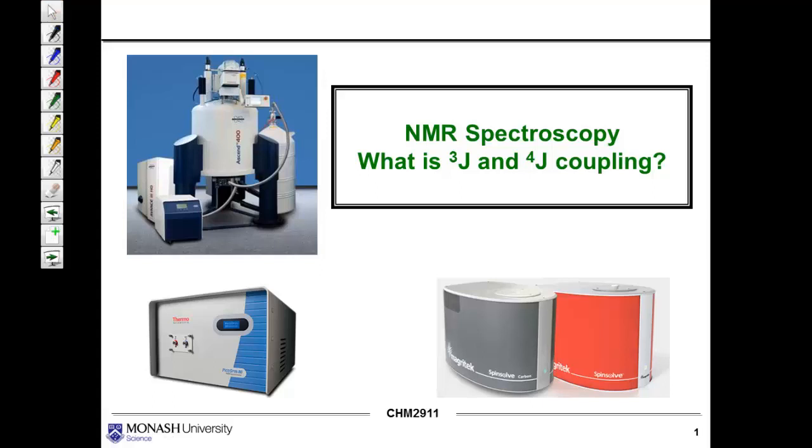This video is just an introduction to 3J and 4J coupling, which will be needed for the NMR workshop that you will be doing. So what is coupling?